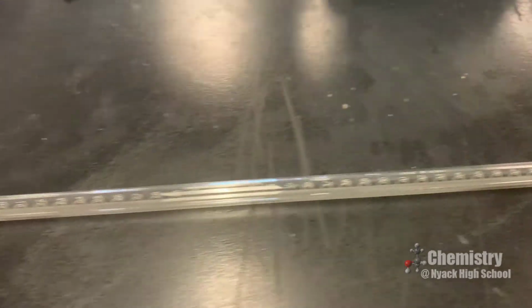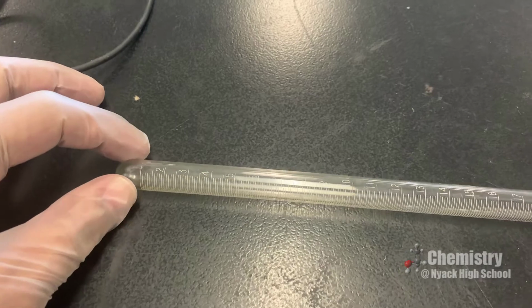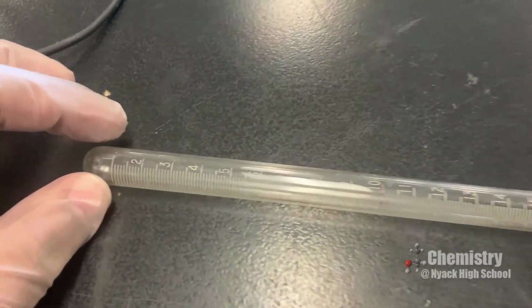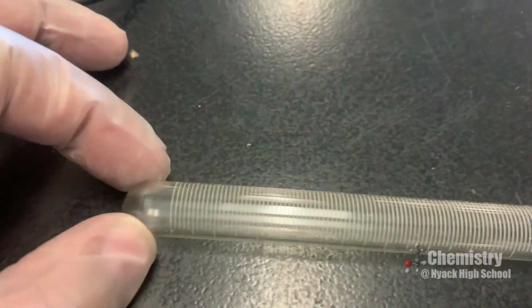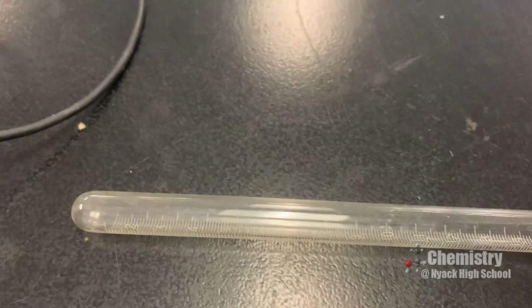Okay, so this is a eudiometer. It is a piece of glassware that is used to collect gases over water. Notice that there are gradations on the device. Notice that one end is completely sealed and the other end is opened. And we will use this to collect the hydrogen gas in this experiment.